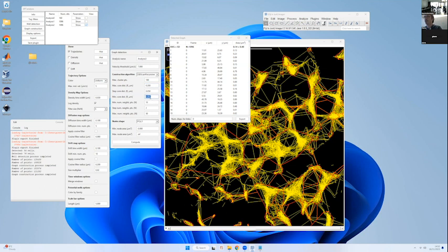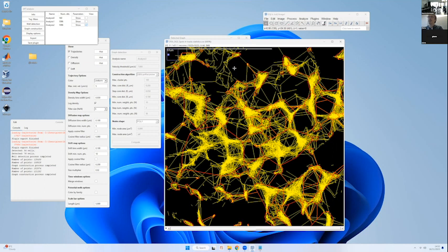R min 0.1, R max 0.2 is good, and then that would be the parameter. So just change R min to 0.1 and the mean core distance and the velocity threshold to 7. And this is a bit longer, so yeah.